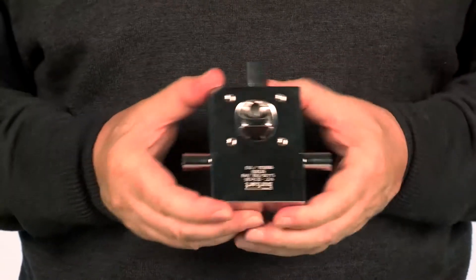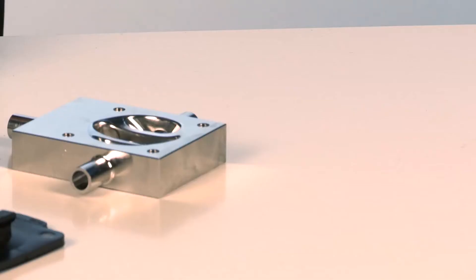With this format we can start to add more and more seats to a smaller block of stainless steel. In fact, it's quite possible to have two, four, six, eight, even ten valve seats on a single valve block using this double weir Roblox valve solution. That kind of solution is just not attainable with a conventional single weir two-way diaphragm valve.